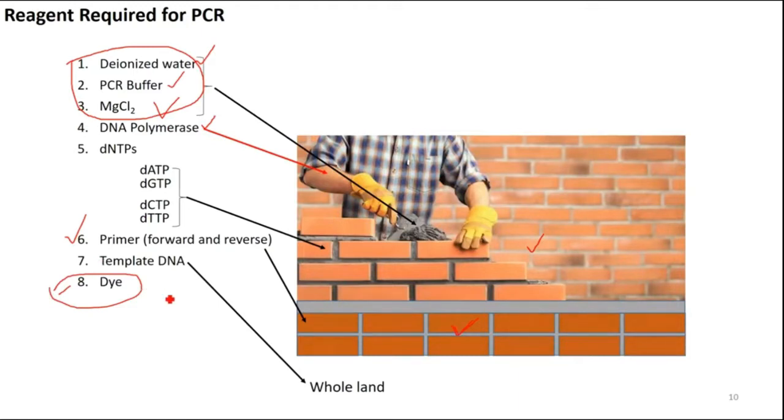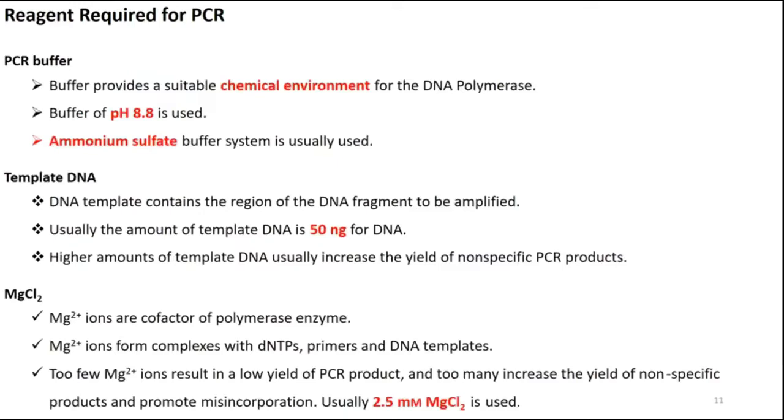All of you know the pH and the requirement of PCR buffer, DNA template, magnesium chloride.